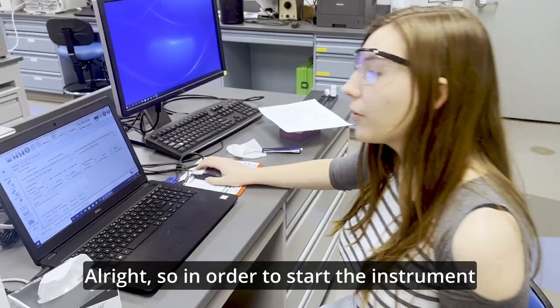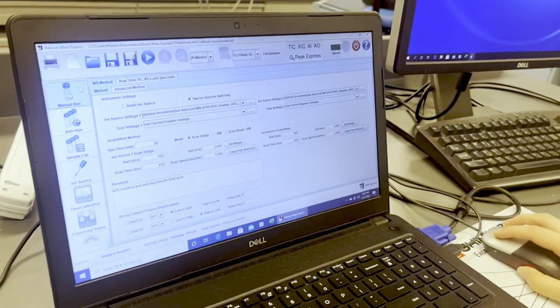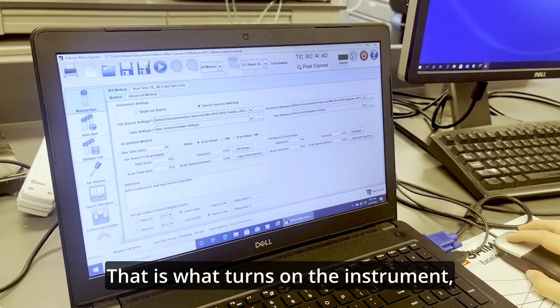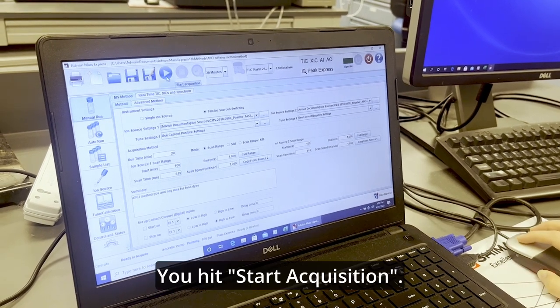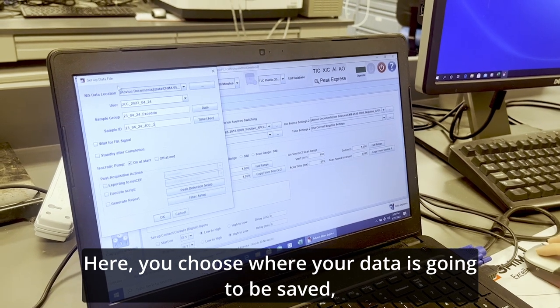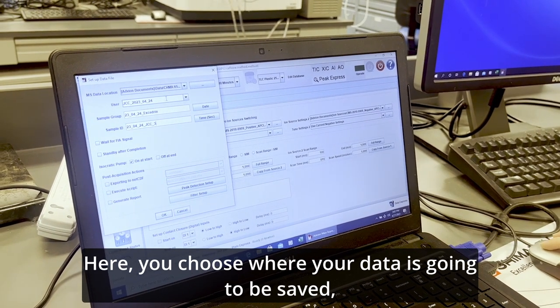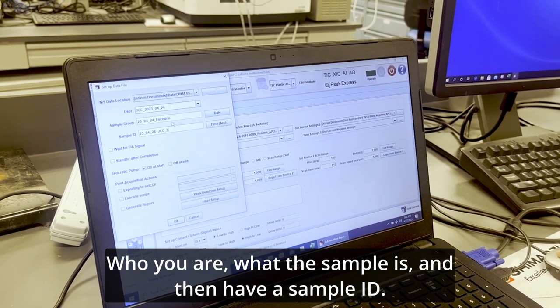All right. So in order to start the instrument, you pull up manual run. Now first, this has to be selected. That is what turns on the instrument, but this has already been selected by CJ earlier. You hit start acquisition. Here you choose where your data is going to be saved, who you are, what the sample is, and then have a sample ID.